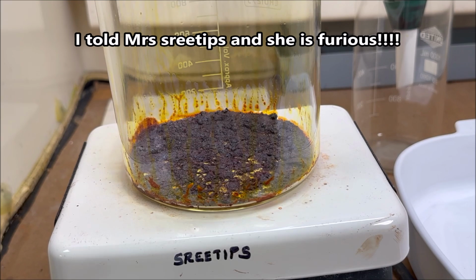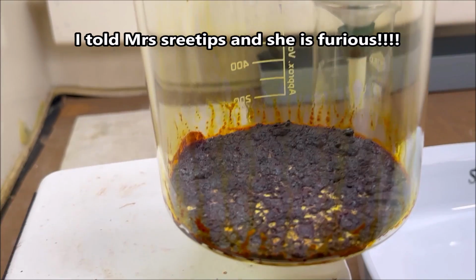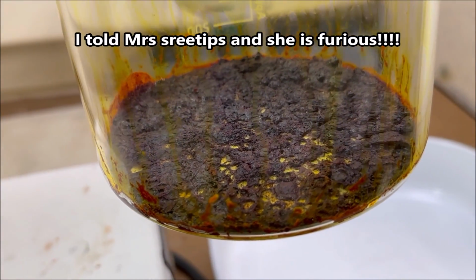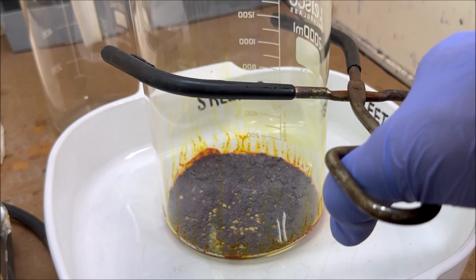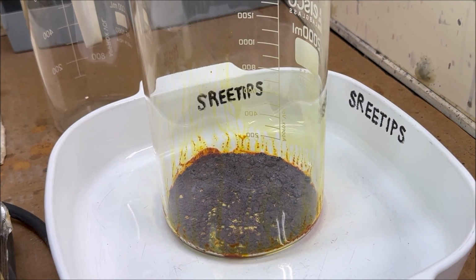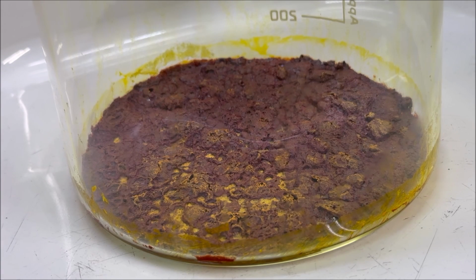All right, I think we burnt the bacon. I don't know what that is, man. I hope we didn't hurt it. That's a couple thousand dollars worth of gold right there. Take it down, let it cool off. Here's our gold solution, evaporated down to dryness.